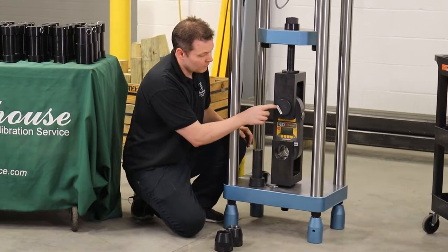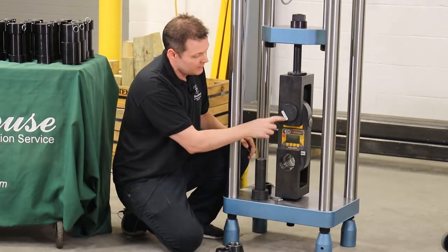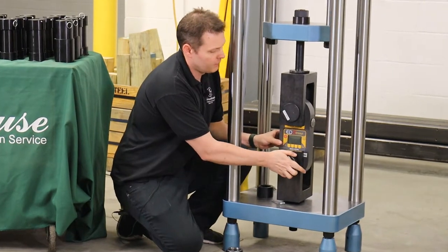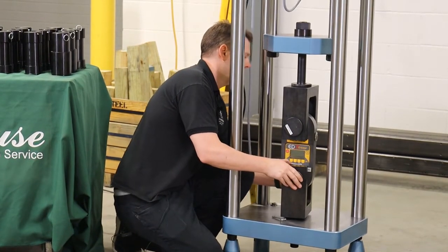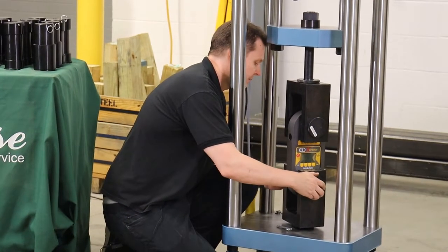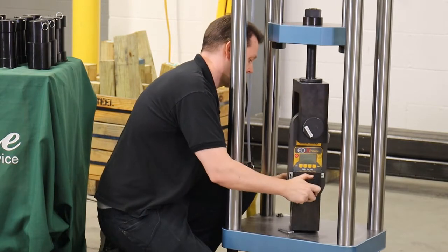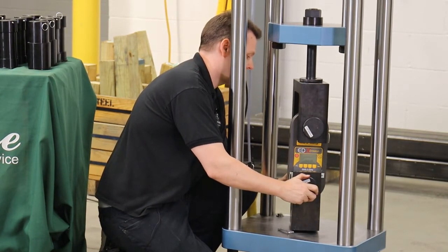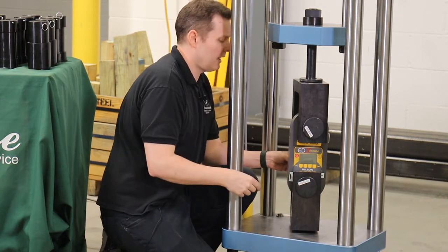As you can see, all the adapters are labeled. We've also put white tape on them to make it very visual for our technicians to find the right adapter quickly. I put the adapter on the other side, line up the pins, line up the pinhole, and put this in. This way, things won't fall out.